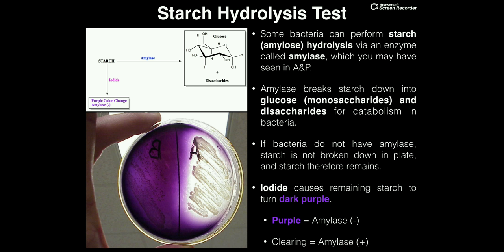Over here on the right side, we see there's a clearing — mainly in the center of the right side of the dish — where there's no purple color. That's because the A bacteria did produce amylase, and so they cleared this whole area of starch. They metabolized it and broke it down to glucose and disaccharides. There's no starch here because they produce this enzyme. Therefore, if you see a significant clearing on any side of the petri dish, that means they do produce amylase and would be amylase positive.